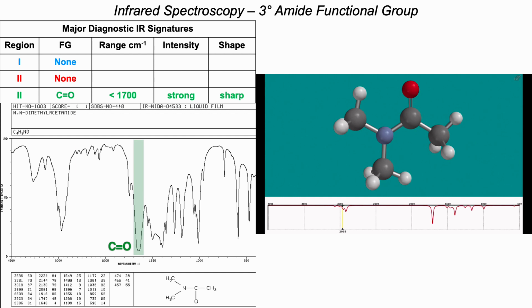So as you're interpreting these clues, you're building a picture of the composition of the molecule. You see a signal below 1700, you can say, okay, there's a carbonyl, there's probably a nitrogen as well, so I have a carbon doubly bonded to oxygen, and that carbon is singly bonded to the nitrogen. So you have 3 different elements accounted for. You have a degree of unsaturation in the carbonyl group, and that can help you start constructing a molecular structure from those elements.